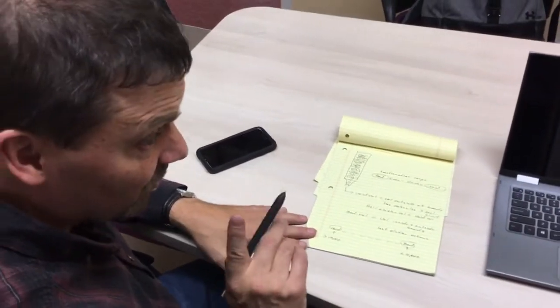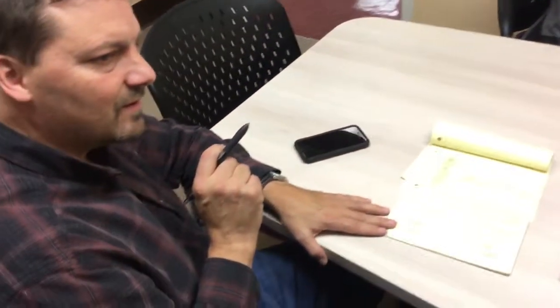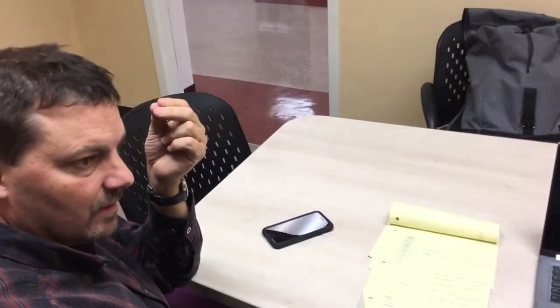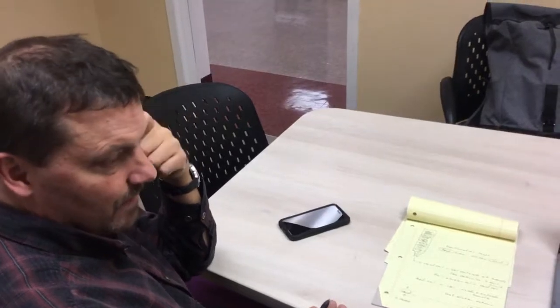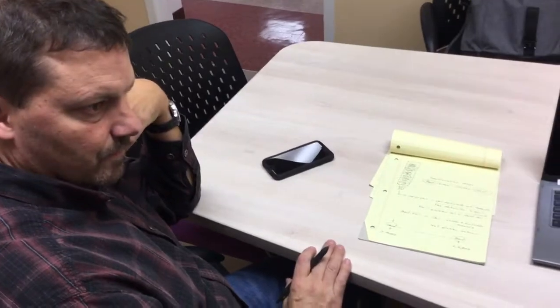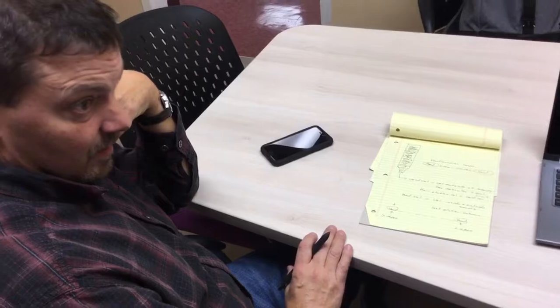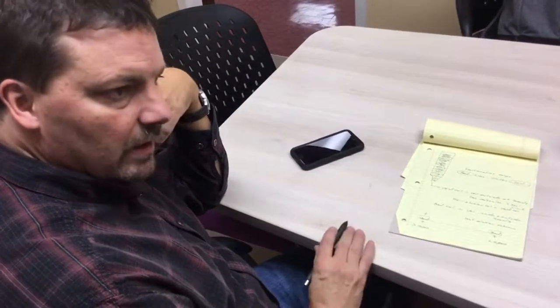If your sample's elution volume is the void volume, what can you tell me about that molecule? We would know the size of it. How big is it? 100,000 or bigger. That's right, and that's in Daltons. If it were to come out in the bed volume, what can you tell me about it? It's 5,000 or smaller. That's right. And all these fractions represent something in between.